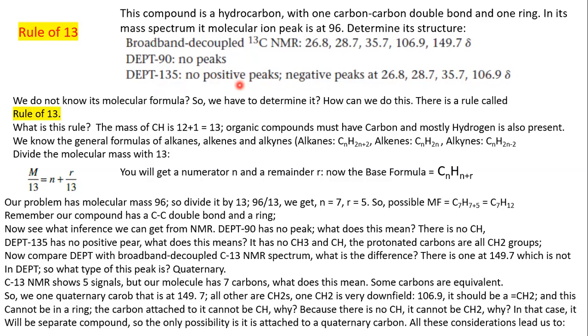Now, in DEPT 135, which carbons give a positive peak? Methine carbon and methyl carbon, yes. The carbons having an odd number of hydrogens, methine and methyl.